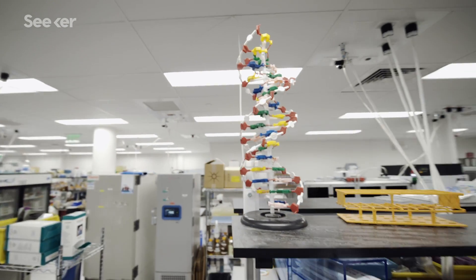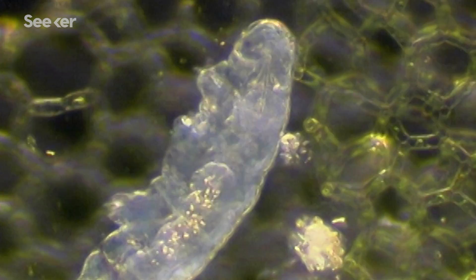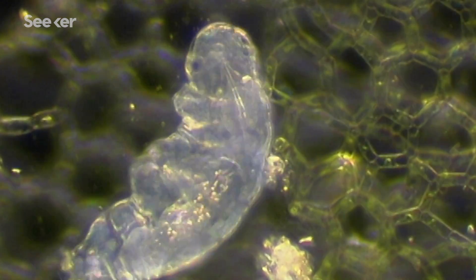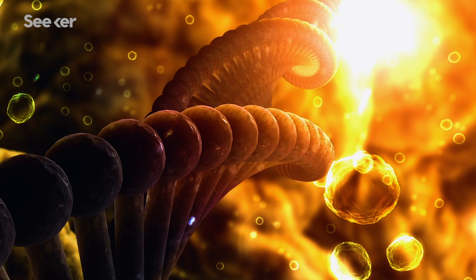It's the DNA that designs what the microorganism does, what the organism looks like, how it acts, if it will grow or if it will not grow. It all comes down to DNA.